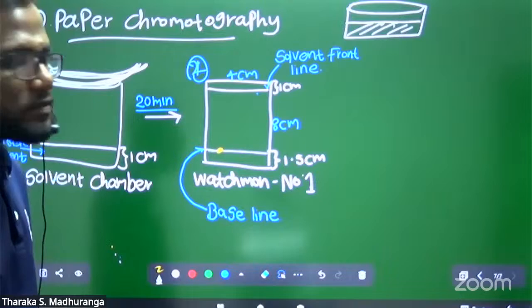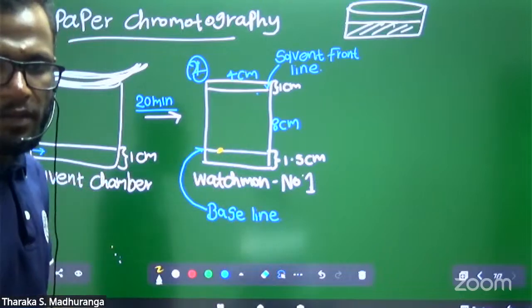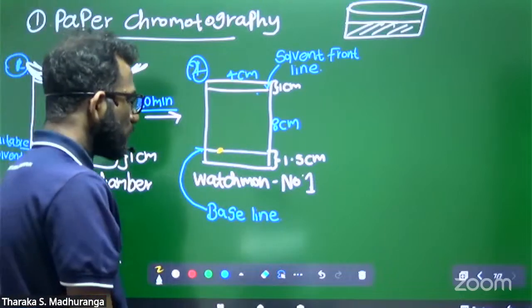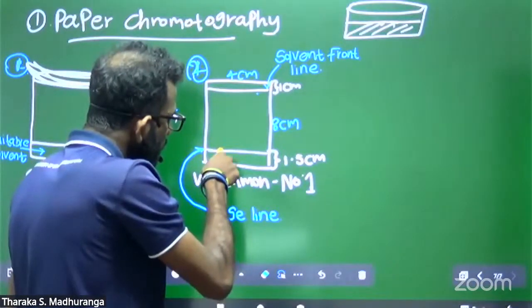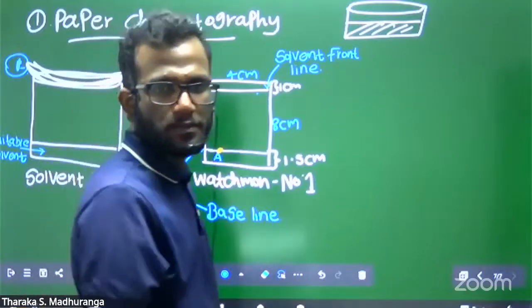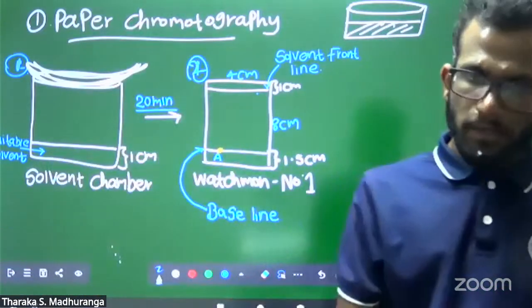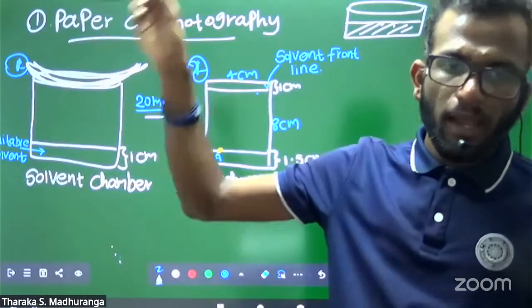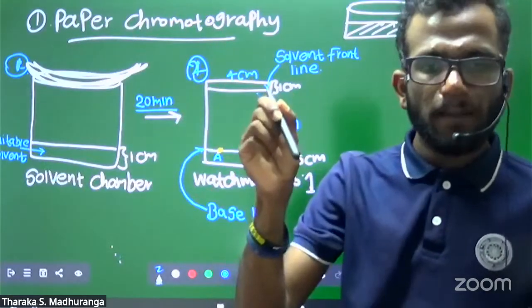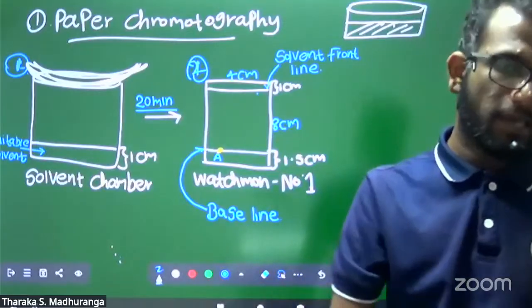I will name it sample A. I put a very small sample from the crude product, and I name it A.